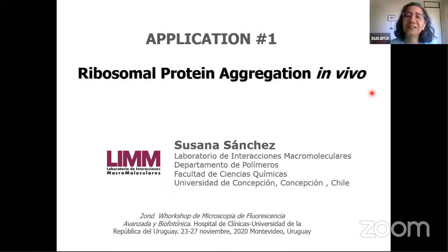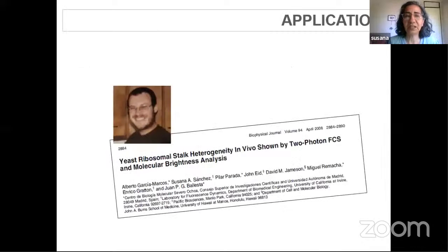Okay, thank you, Leonel, and thank you for the invitation. This is a talk that we normally put in this course because it's a real nice example of a technique that is called circular scanning FCS. The person that is there is Alberto Garcia Marcos. He's from Spain, and he was a graduate student at that time who did all the work that I'm going to present. His boss was Juan Pedro Ballesta, and as a collaborator, we have here also Dave Jameson.